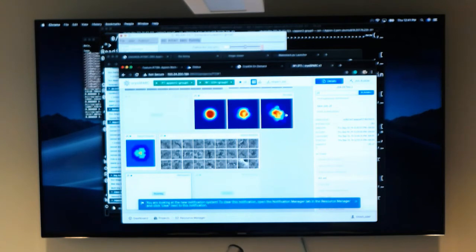It's the right job to particle. The original is job 1 particle, so it's different. And job 2 is. Saw that. Yeah. I think particles get selected and this is from average and the calculate, so it's different. Then it already excludes some conflicts.